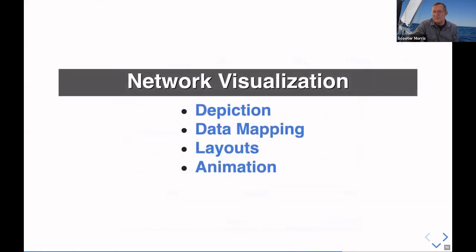And instead, I want to talk about network visualization. This is Cytoscape's forte, and particularly from a standpoint of using this in an automation fashion, there are two things that you typically use Cytoscape for. One is you'll use it for visualization.